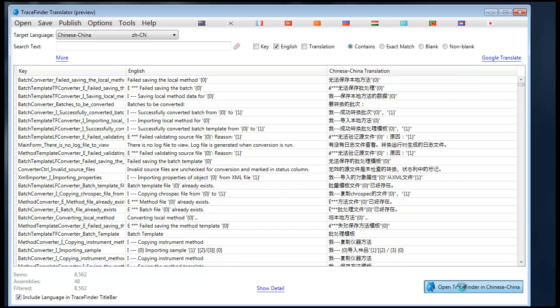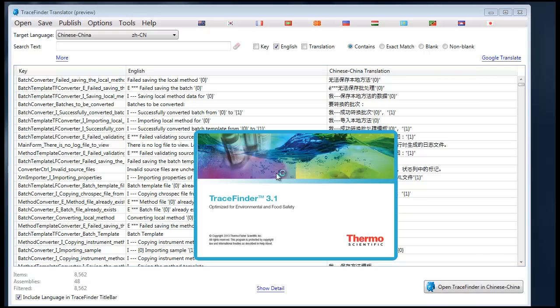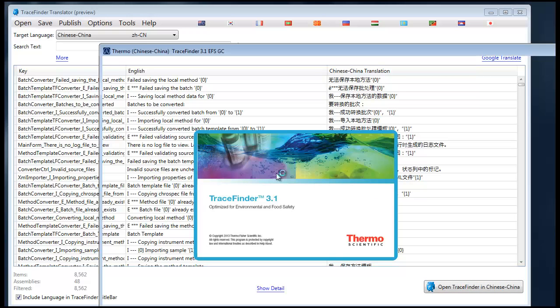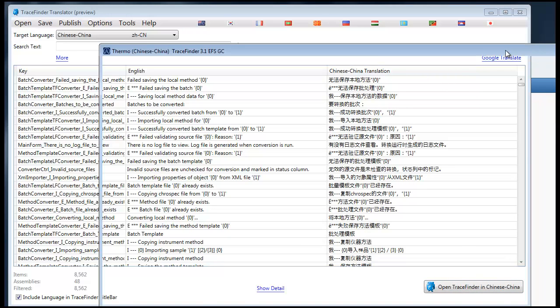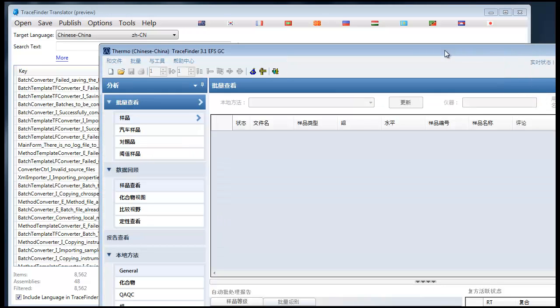To run TraceFinder in Chinese, simply press the Open TraceFinder in Chinese button and the translations will be placed in the right directory and TraceFinder will be opened up in Chinese.